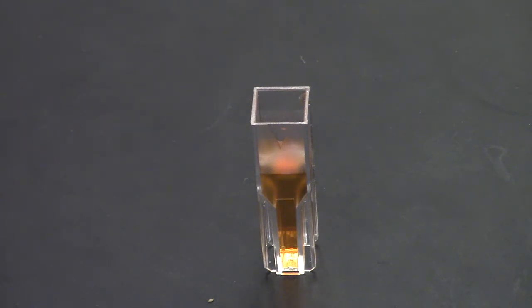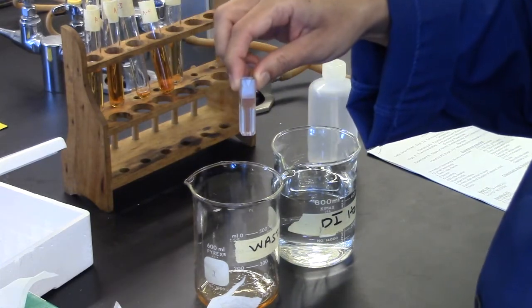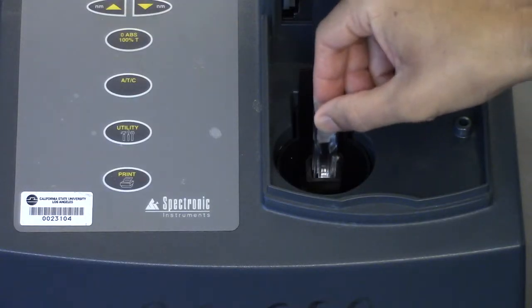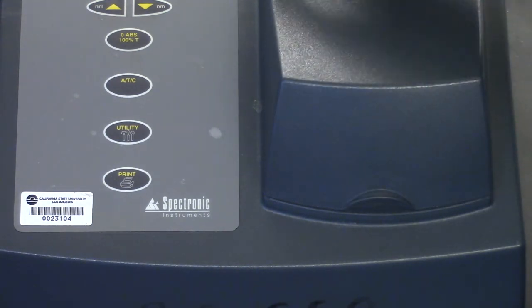When inserting the cuvette into the spectrometer, the arrow at the top of the cuvette should be pointing towards you. Make sure the distilled water blank is wiped dry and insert it into the spectrometer. Close the cover gently.